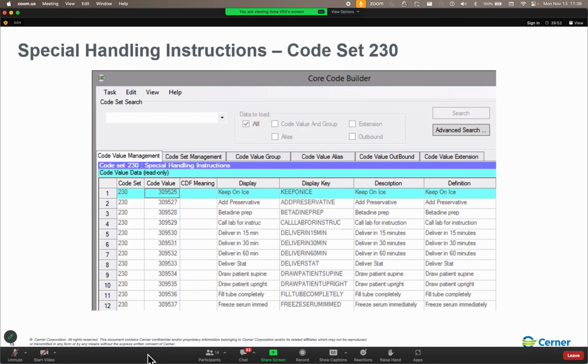Now, folks, like I said, the Julian dated accession numbers are refreshed every day. The alpha prefixed accession numbers, though, that bucket is refreshed every year. Now, I want you to go ahead and think about that.